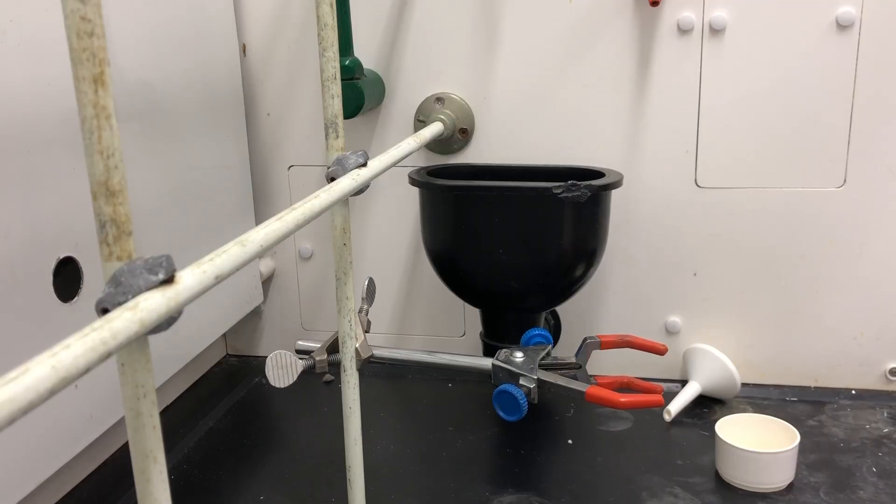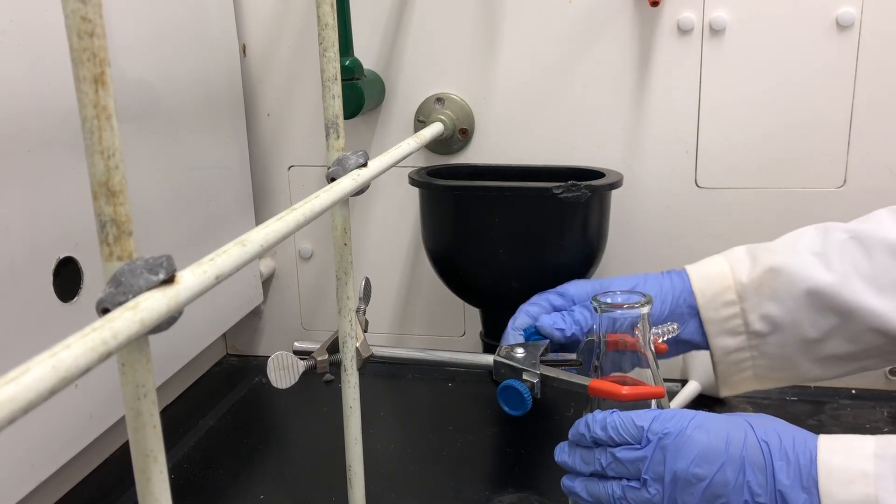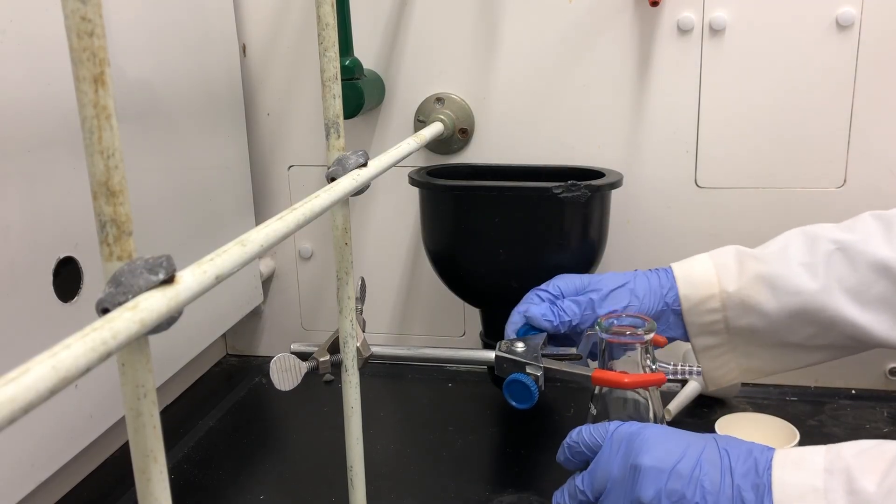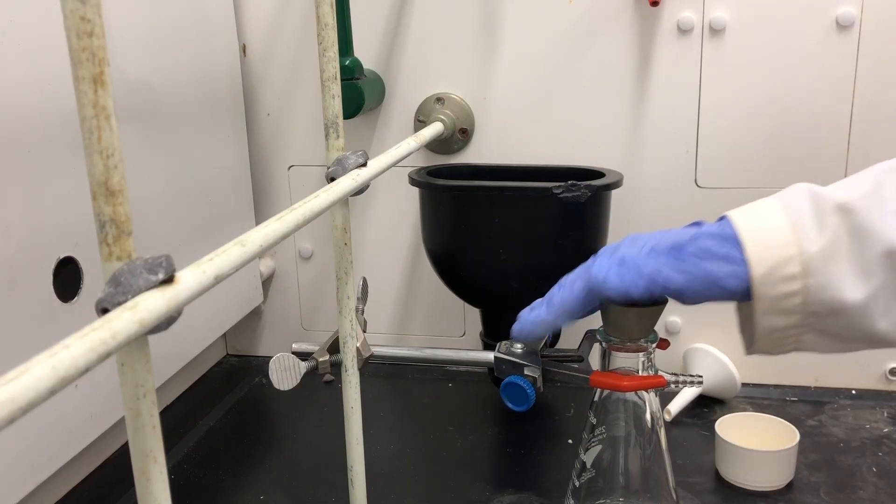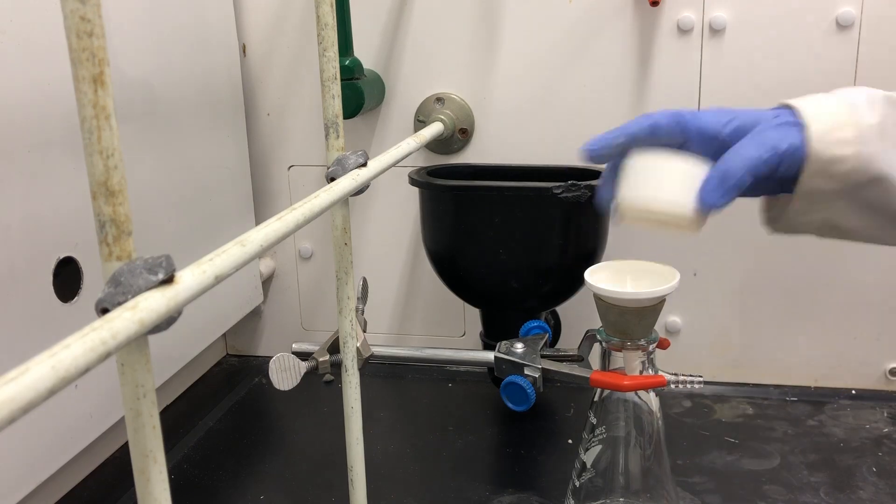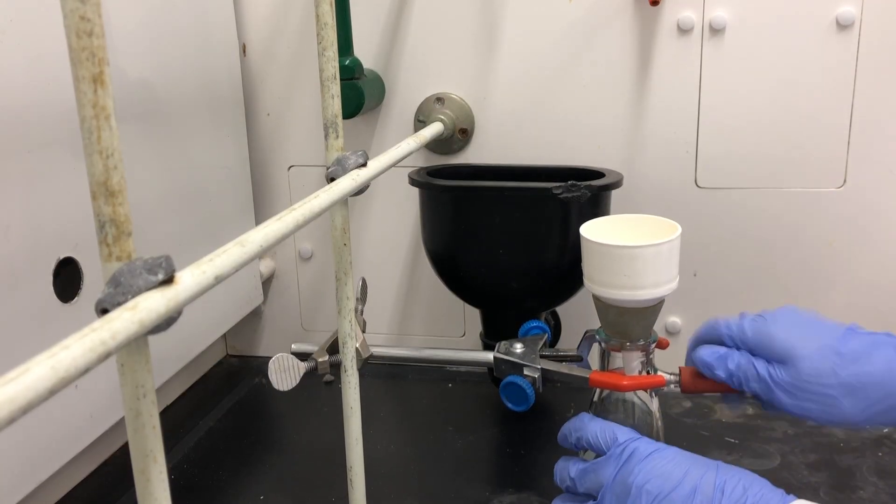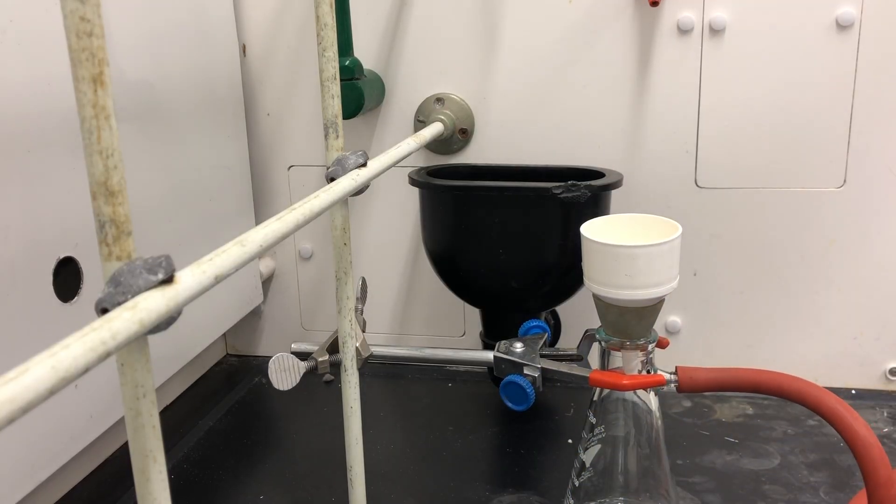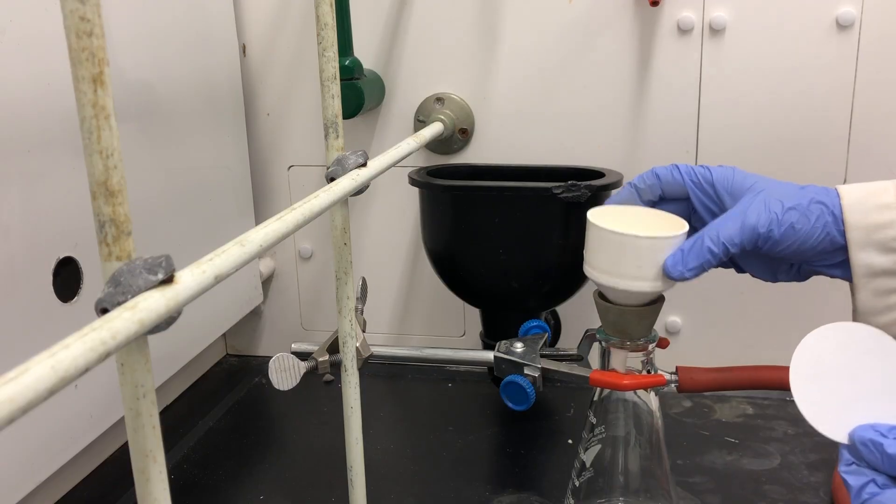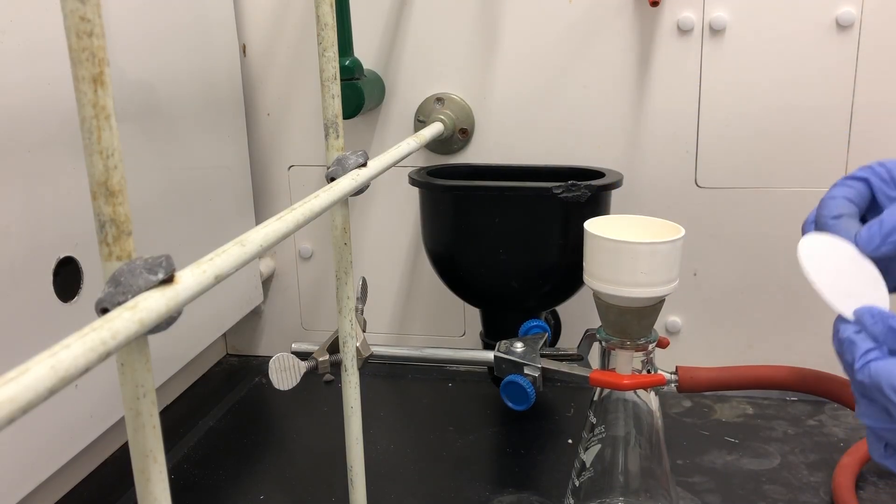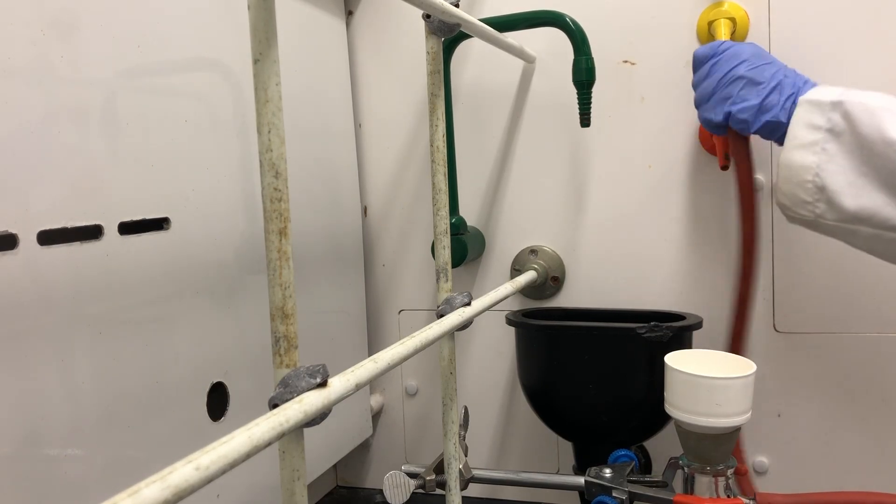We're going to set up the suction filtration. We'll need the three-arm or the side-arm flask to hold the flask when you insert, and then we'll have the two pieces for the Buchner funnel. Then we'll go ahead and clamp it right into the vacuum.